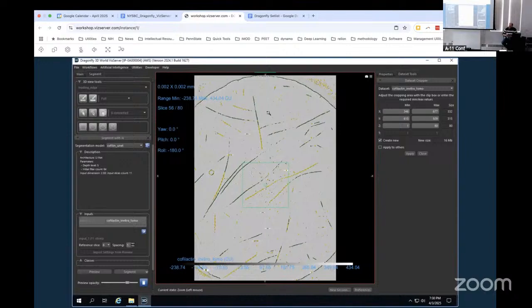And that background itself will override a lot of the network's weights. You have to play around with weighting them. Once you put real and synthetic data together, they balance in ways that are not truly predictable to me yet. But one thing I can predict is that if you don't give it some of the real data for all of the classes, you'll probably not get a great network once you've combined all of this data. It'll override your synthetic data.